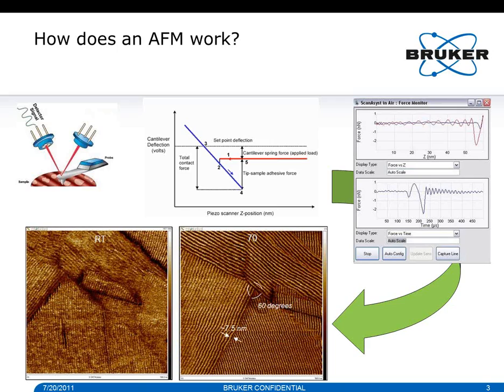You have nanometer-sized resolution in an AFM, and you have sub-micron to micron-sized or even worse resolution in other spectroscopies. However, you get mostly chemical information from other spectroscopies, so it's a great way to combine these technologies, because potentially you get beneficial information out of both that would help you either be more productive or just learn more about your samples.